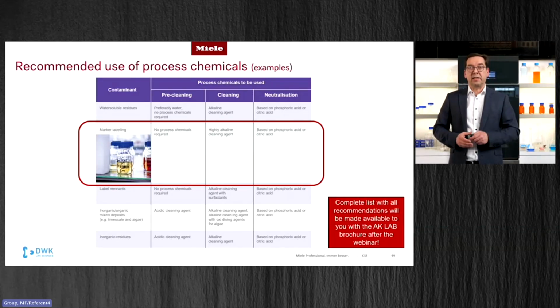And with that, we are coming now to chapter 3 of our webinar, where my colleague Ramona will now make you familiar with the different methods how laboratory glassware could be cleaned and which are the advantages or disadvantages.